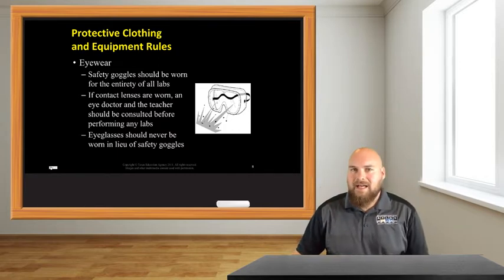All right, eyeglasses are not a substitute for safety glasses.